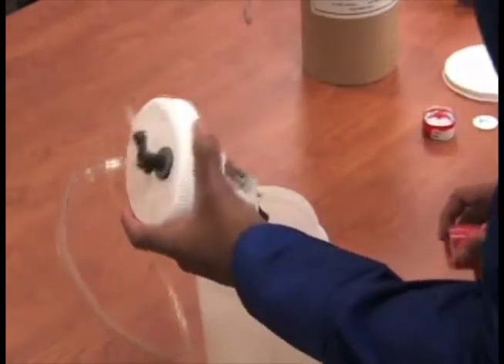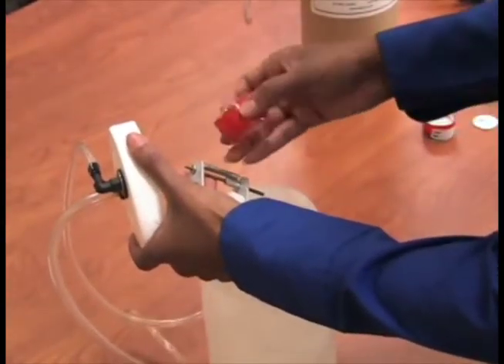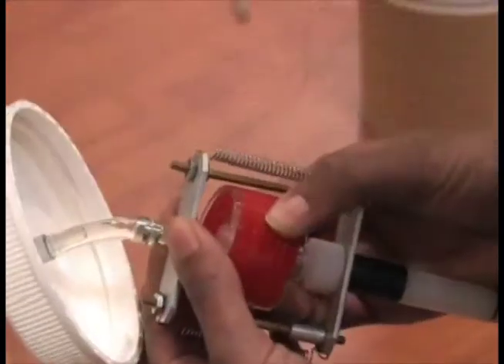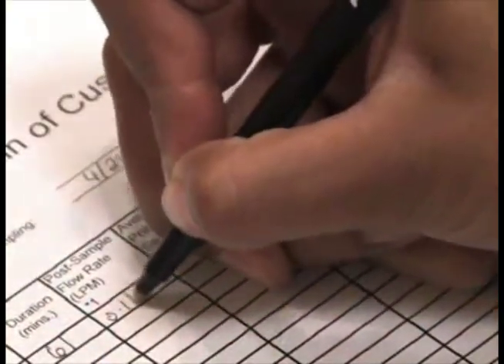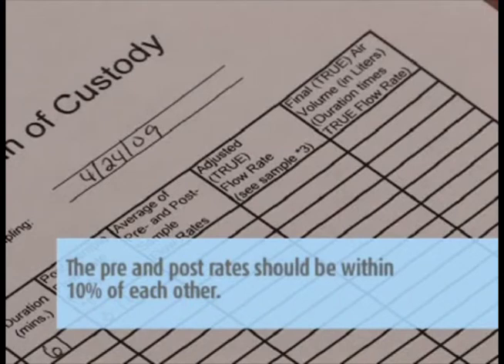After completing the sample, a post-calibration must be performed on the pump. Perform the post-calibration the same way you did the pre-calibration, but do not make any adjustments. Just record the flow rate on the pump calibration sheet. The pre- and post-rates should be within 10% of each other.